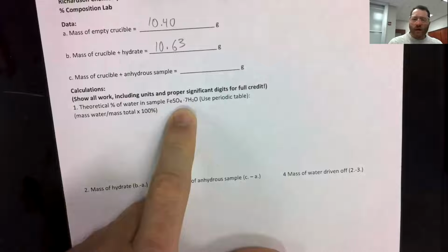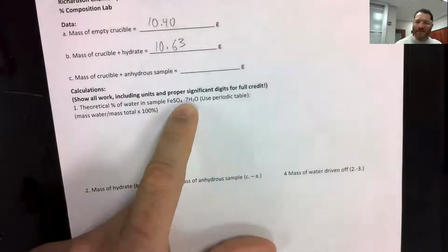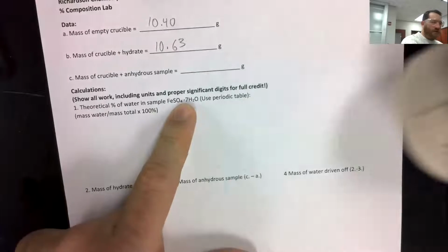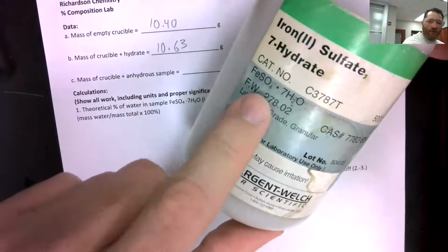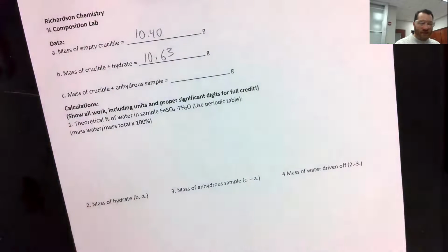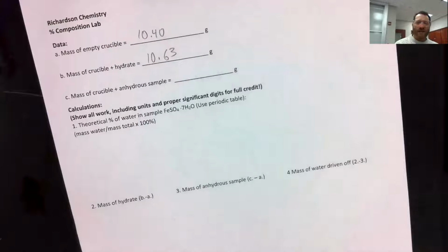A special note: a lot of people in class see that dot and think it looks like a multiplication symbol. It does, I know. It's just how they write heptahydrate. That's how they write all of our hydrates, so you can see it on the bottle there. There's that little dot. It's not a multiplication symbol. Do not multiply by 7 H2Os. It's a mistake a few people made in class, so watch out for that.